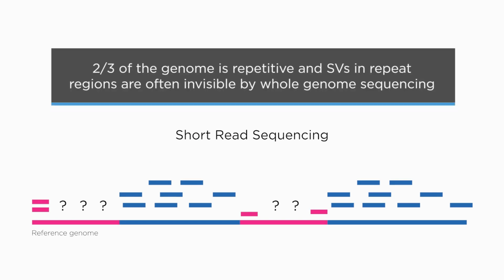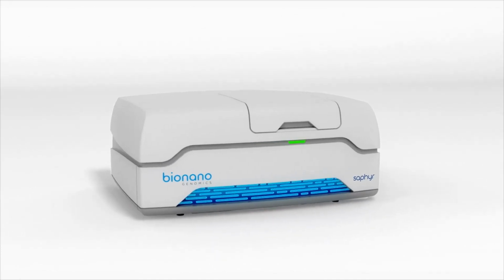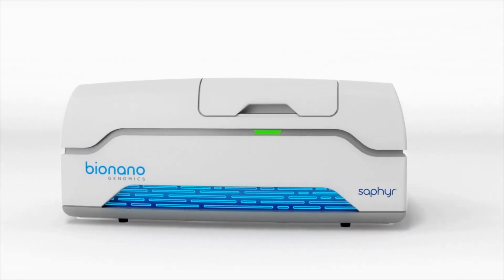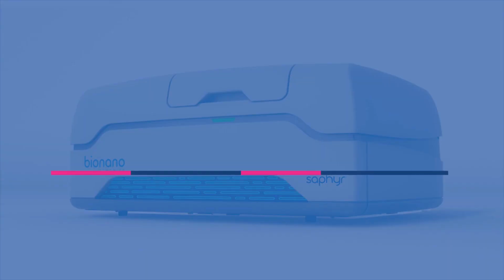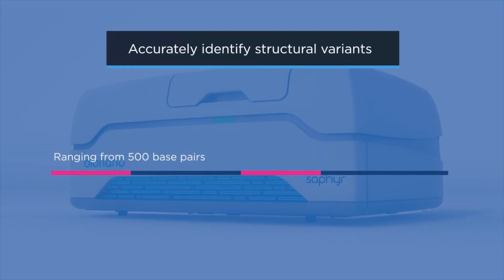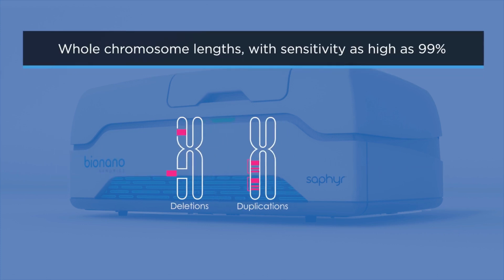What's more, 2/3 of the genome is repetitive, and structural variants in repeat regions are often invisible by whole genome sequencing. Whole genome imaging with the Saphyr system takes an entirely different approach to understanding the structure of DNA through imaging. It has proven to accurately identify structural variants ranging from 500 base pairs to whole chromosome lengths with sensitivity as high as 99%.